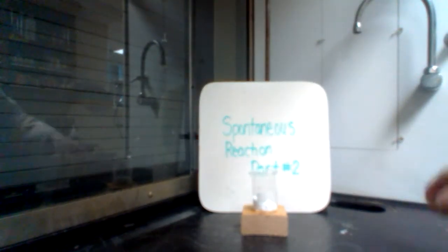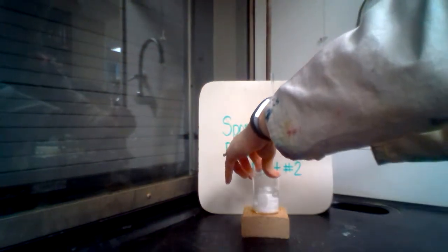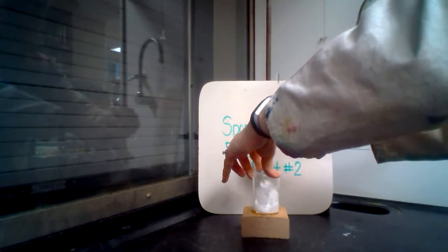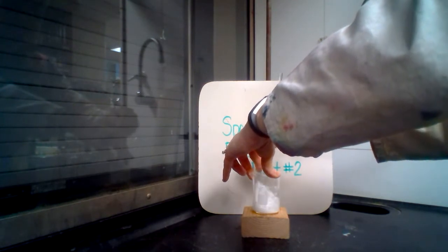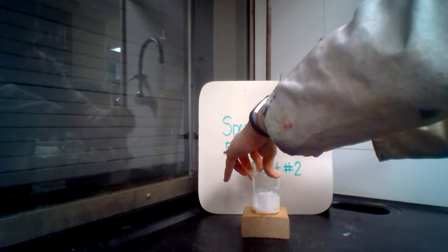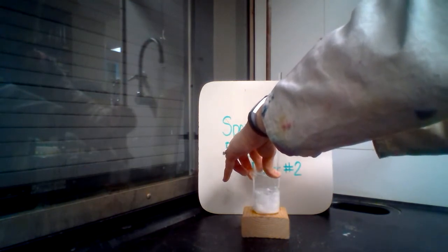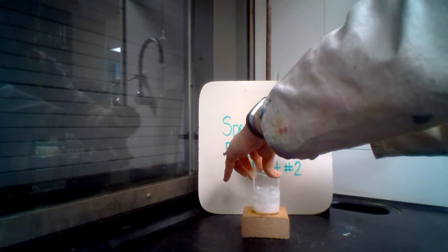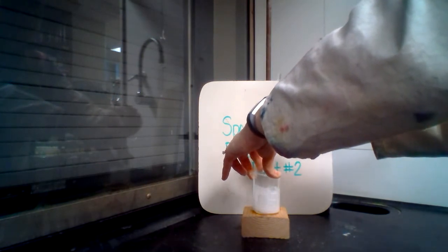I'll take my stir rod and stir the two solids together. We'll notice that the change of matter is changing from our solid. I want to also note that the smell is pretty strong.